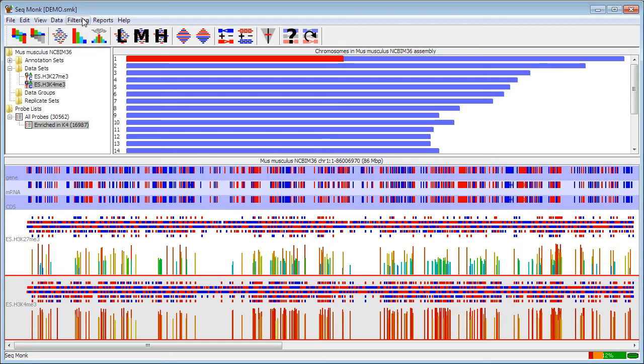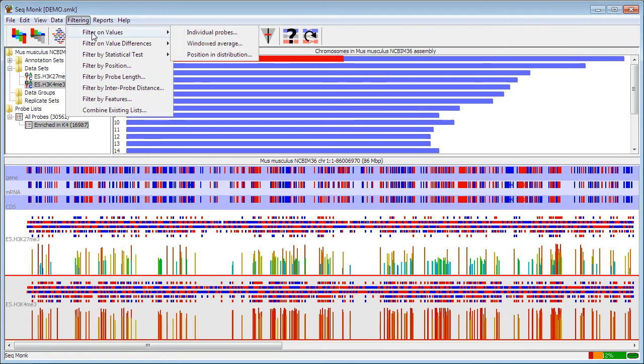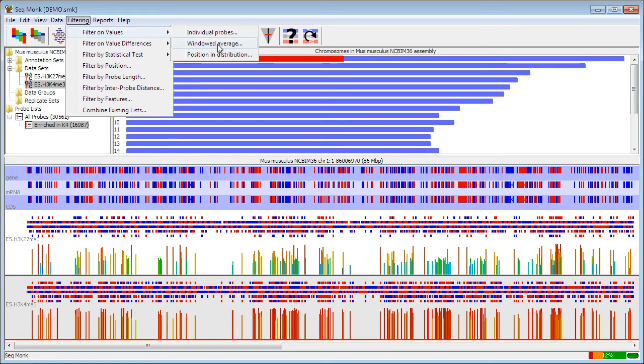To go through the other options that you have in the filtering menu here, the simplest kind of filter is to filter just on the values that you have. This applies to the currently quantitated values, and it's perfectly possible to re-quantitate your data in several ways whilst preserving your current list of probes. The simplest one of these is to filter on individual probe values, so that's filtering every probe independently from every other one. You can also choose to filter over a window where you specify a larger region, and the value will be averaged over that window, and the set of probes within that window will pass or fail as a whole.